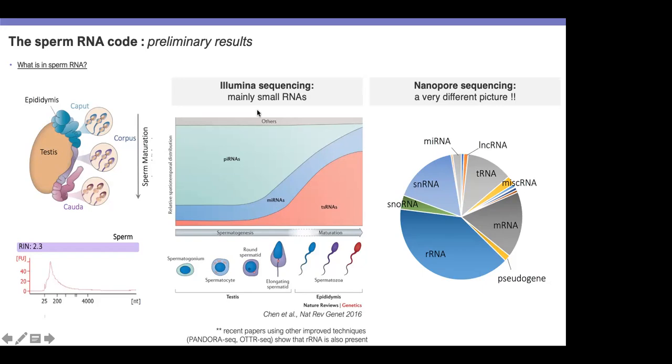In principle, there are going to be some differences between your pseudogenes and your main gene, or let's say the one that is not a pseudogene. So long read sequencing should alleviate these issues more than Illumina, but you will still have issues like multi-mapping, so you still need to figure out a way to map your reads to avoid them. For example, ribosomal RNAs are in multiple copies. Now we will also be sequencing these samples with Illumina. Were the previous studies not capturing the ribosomal RNAs because they were not reverse transcribing them, or because the mapping was discarding all of them since they are multi-mapping? You would lose those reads because you only count uniquely mapped reads.